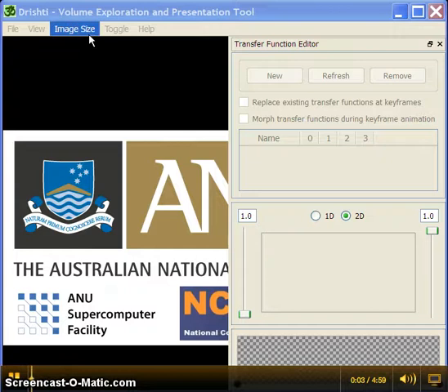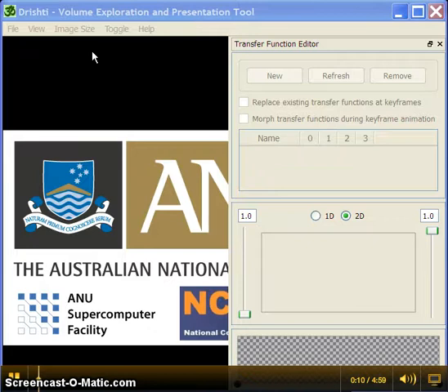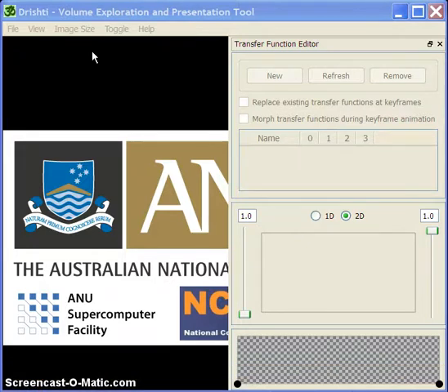This video shows how to modify color and opacity of the first volume using the mix option. You can mix color, or you can mix opacity, or you can mix both color and opacity of transfer functions from set 1, 2 or 3 and apply it to set 0. Basically, apply transfer functions that affect volumes 1, 2 and 3 and apply those effects onto volume 0.